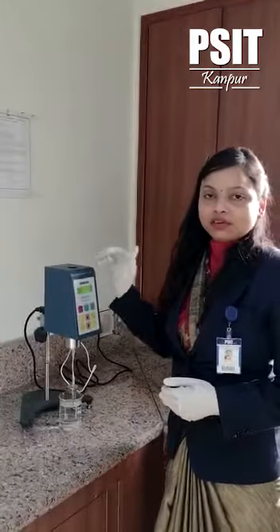Good morning everyone. I am Dr. Ruchi Tiwari, Associate Professor, Institute of Pharmacy, Pran-Mursing Institute of Technology. I will demonstrate the working of Brookfield Viscometer DV2 Probe.